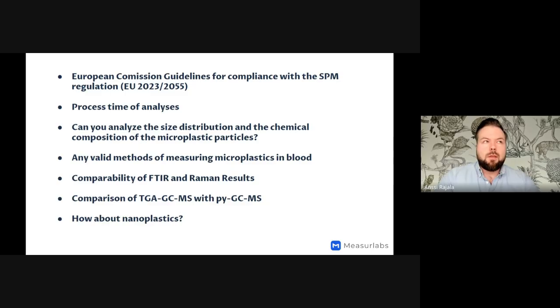If it's not a very simple matrix and needs digestion, then organic solvents might be a bit problematic with hydrogen peroxide, but I think there might be other solutions for that.